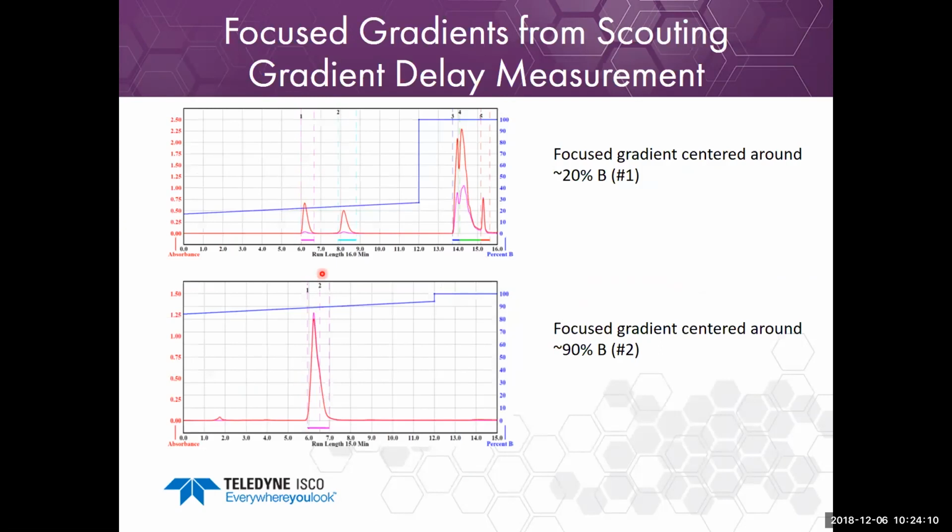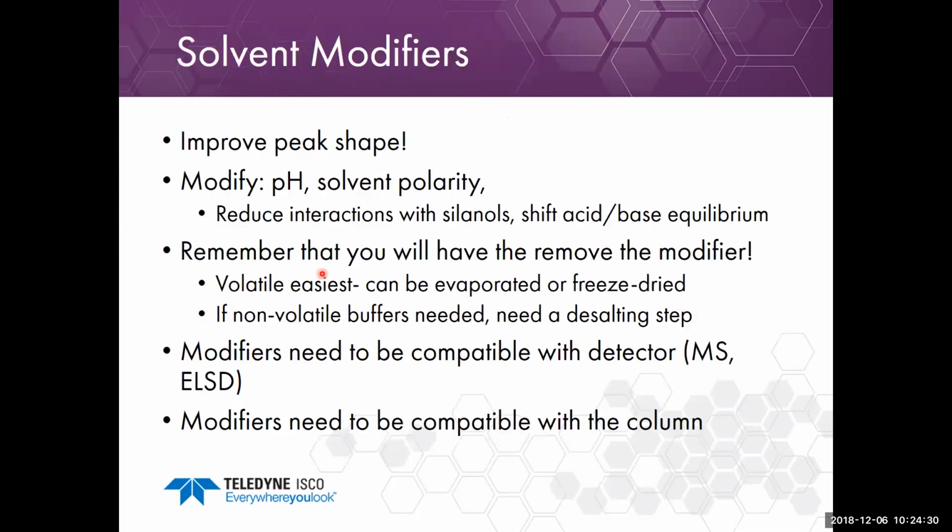The method can be further fine-tuned, and next year we will have a webinar describing how to accurately calculate a gradient from a scouting gradient. There's a couple of other parameters that can be applied to make it very precise. However, the method I just described will get you very close indeed.